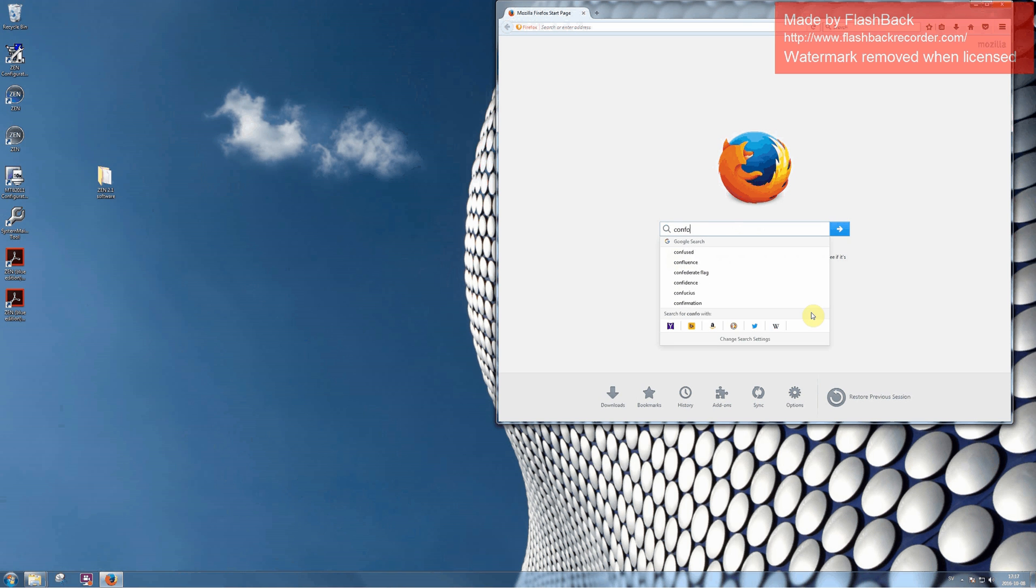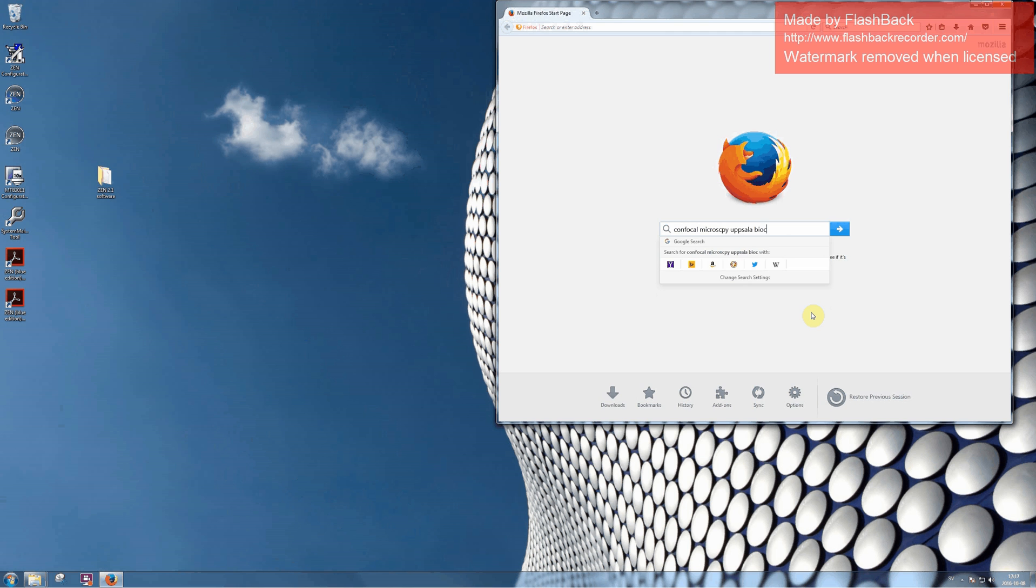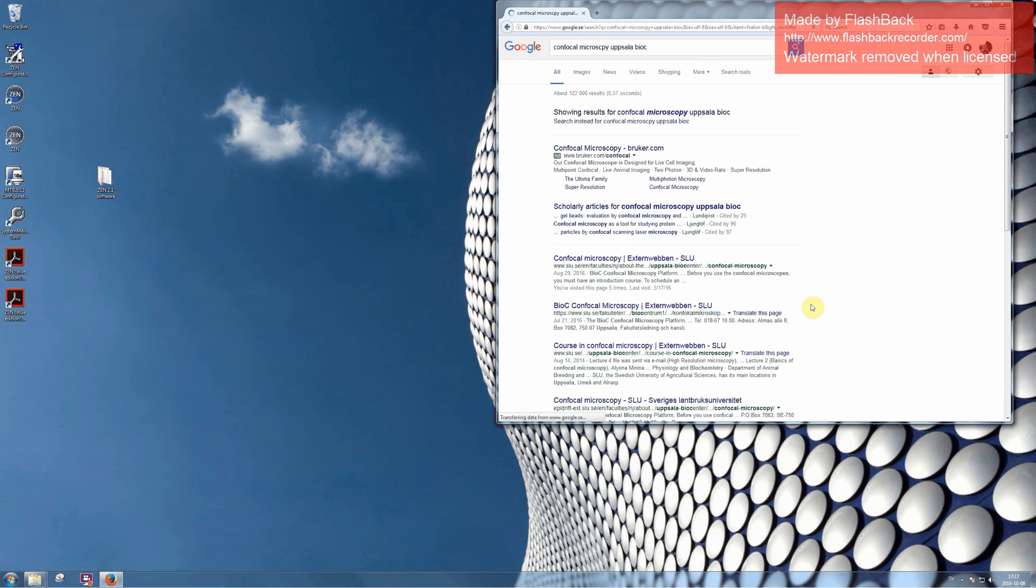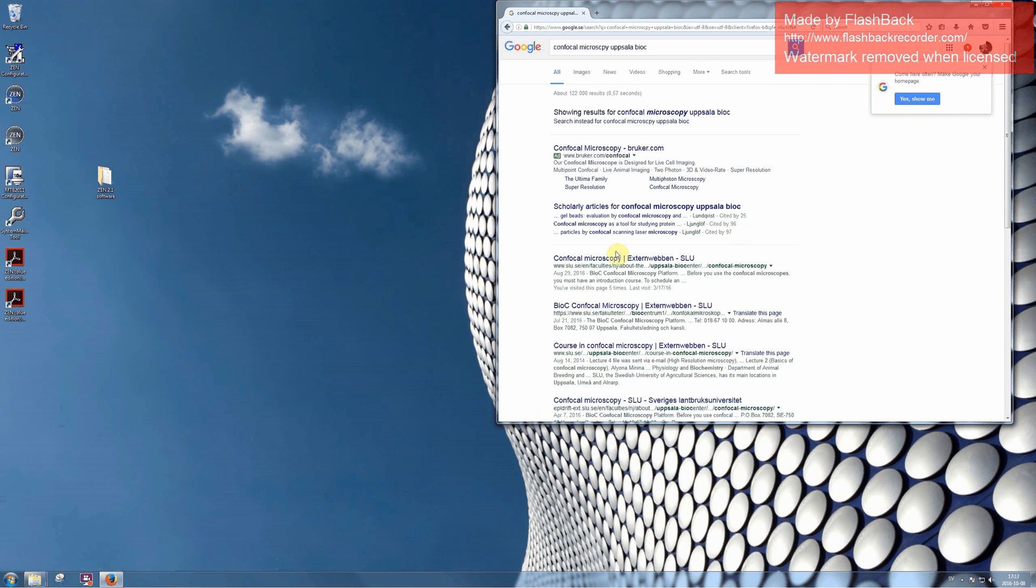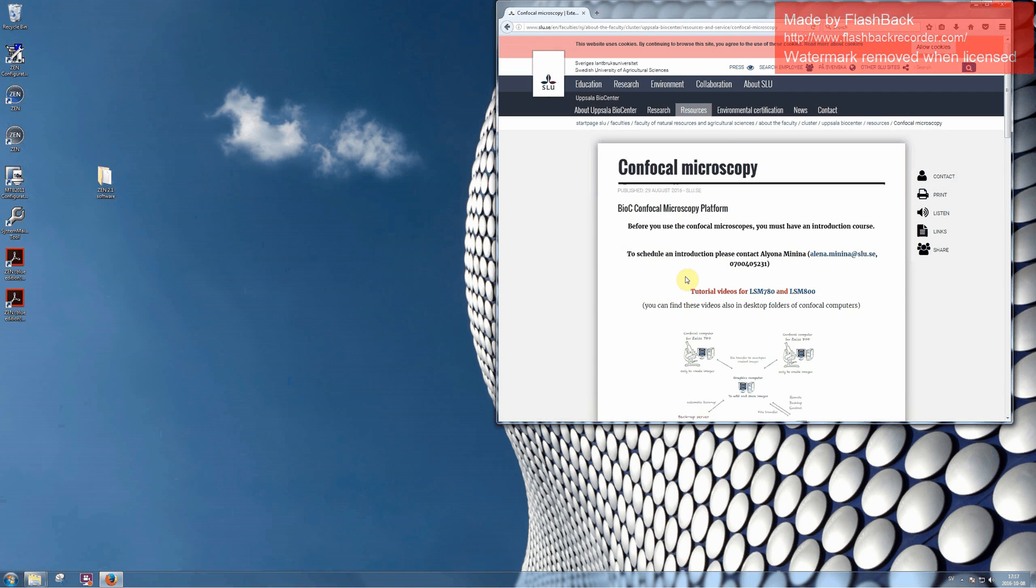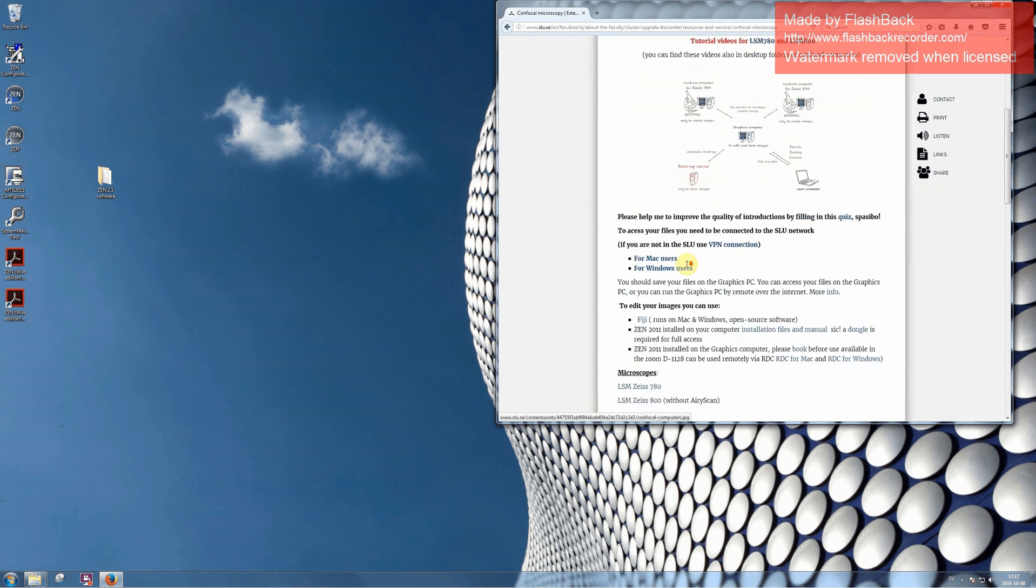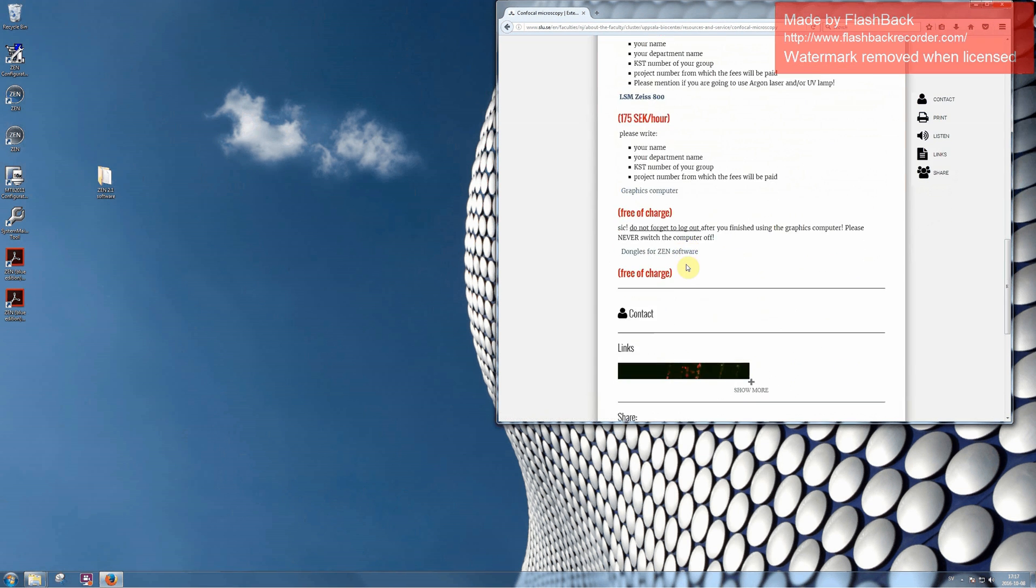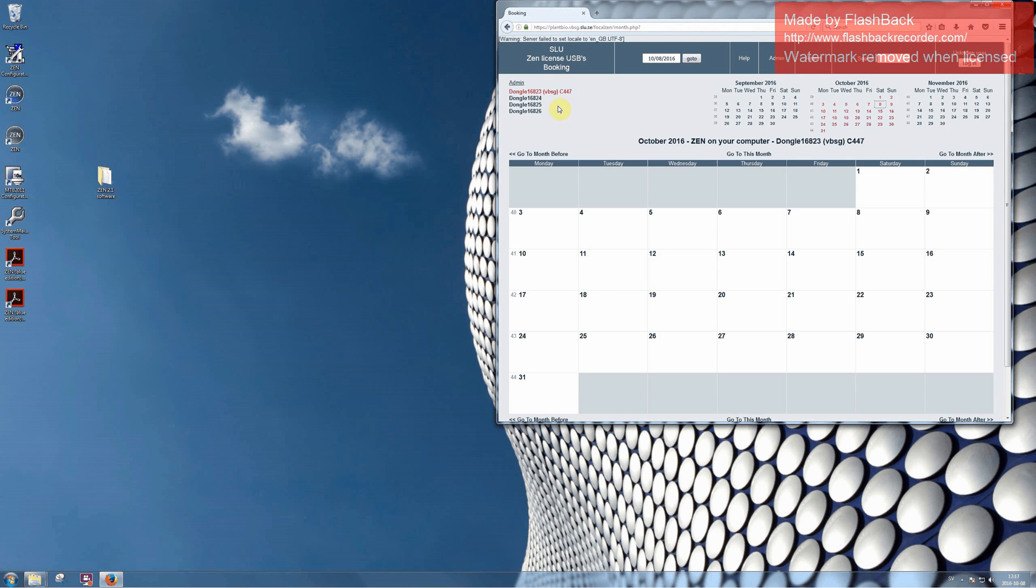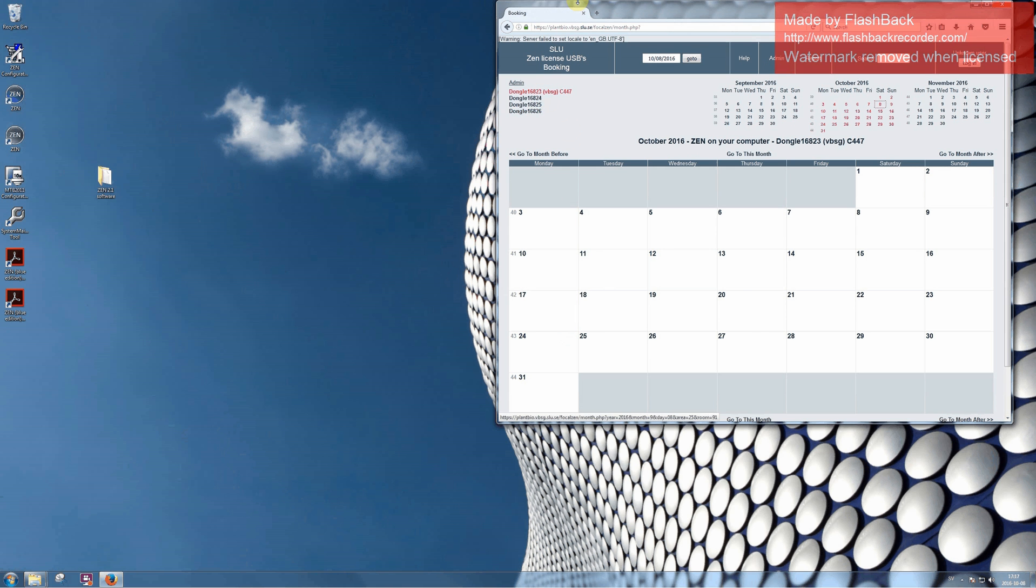To book it you should go to the website of Confocal Microscopy platform and find a booking calendar for Dongles. As you can see we have 4 Dongles available and you are welcome to book any of them.